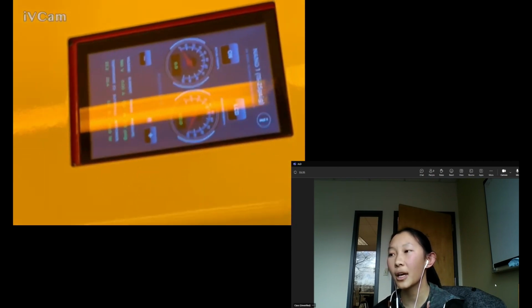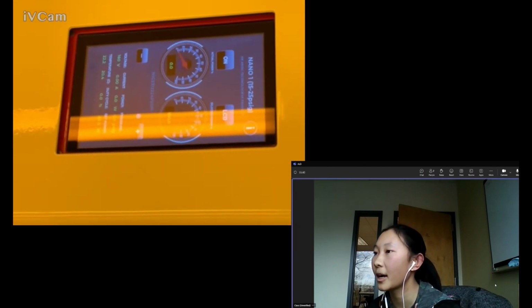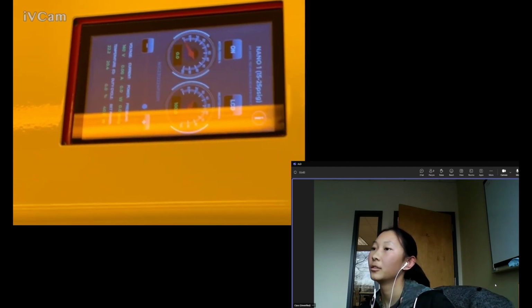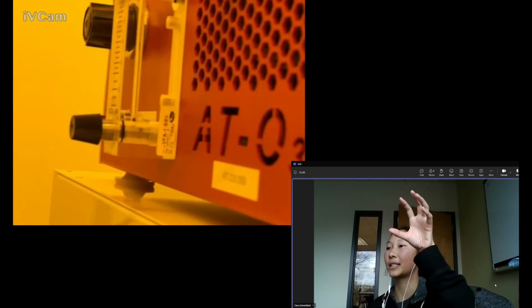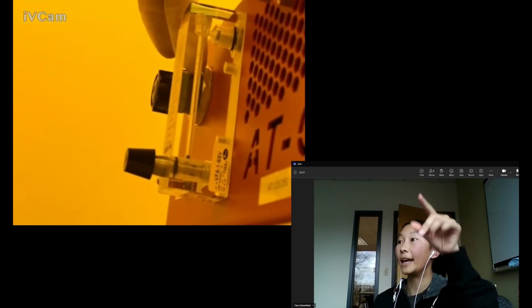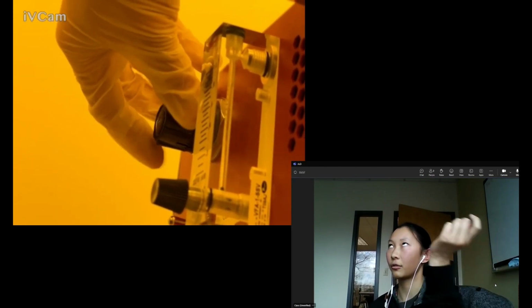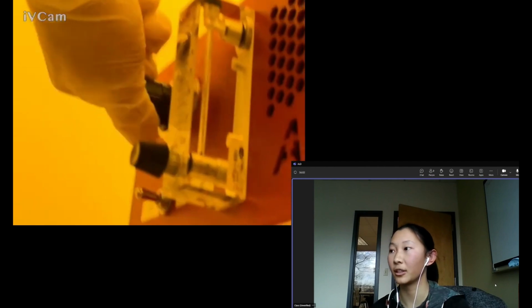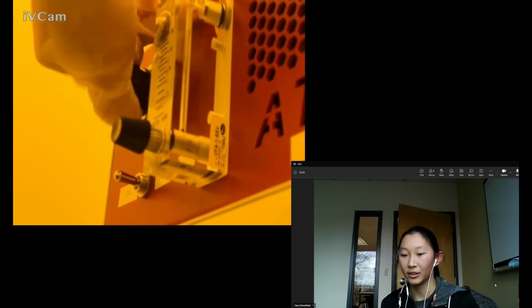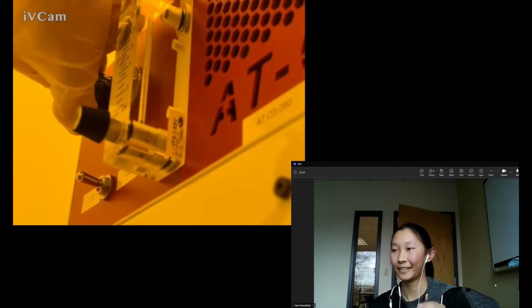Sometimes the dial, you really have to crank it to get a reading. So maybe it's that. I would release the dial. You pull it out and then you turn. Like this one on the side here? Yeah, the big plastic knob. This one on the back? Yeah. So pull it out and then clockwise or counterclockwise? Counterclockwise. You really have to crank it sometimes to see a reading. That knob can be particular. Yeah, it's still going.